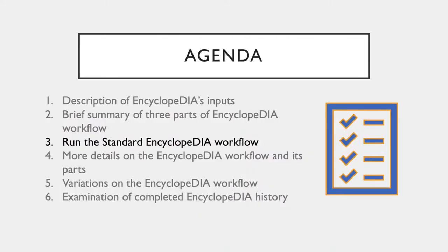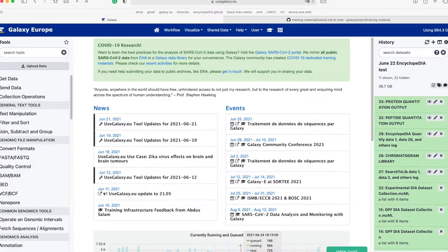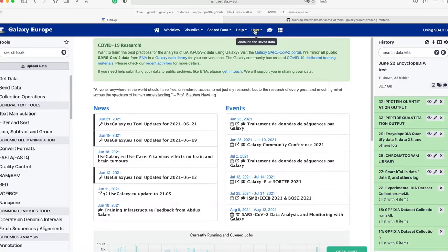Now that you are familiar with the three steps of the workflow and the general Encyclopedia inputs, we are going to run the Encyclopedia workflow together on Galaxy EU. Go to the Galaxy EU site at usegalaxy.eu. If you do not already have an account, it is easy to make one by clicking 'Log in or Create an Account.' Once signed in, we are ready to begin.